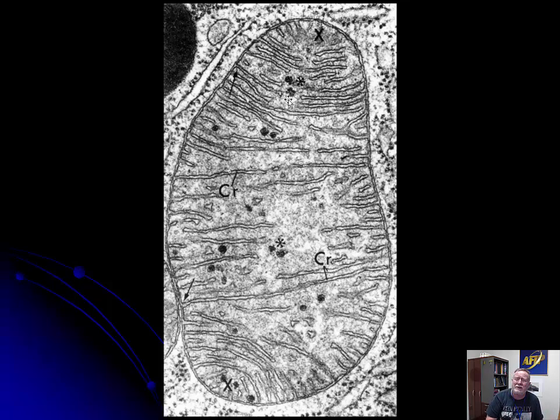They don't normally get a lot of oxygen, so they tend to have sort of runty, stunted cristae. Okay, they don't see oxygen, they've evolved not to use it and to use a lot more anaerobic glycolysis. Okay, remember that mitochondria has mitochondrial DNA as well. You can't see that, but the site of transcription is also in this granular matrix.